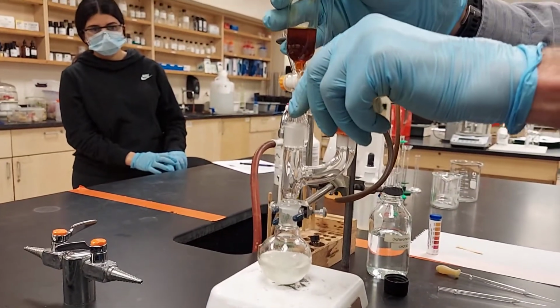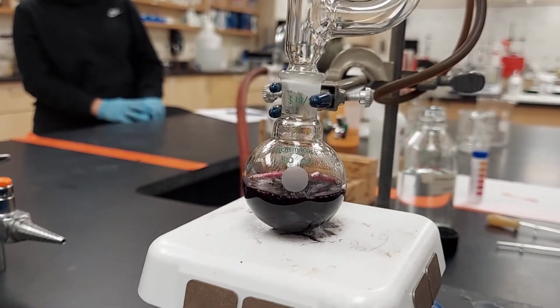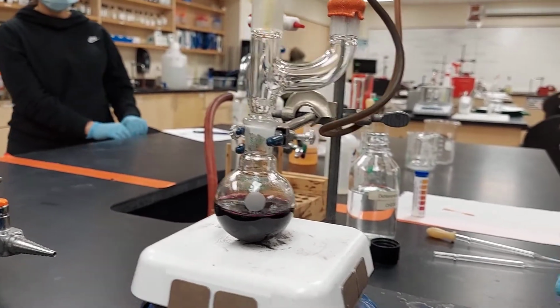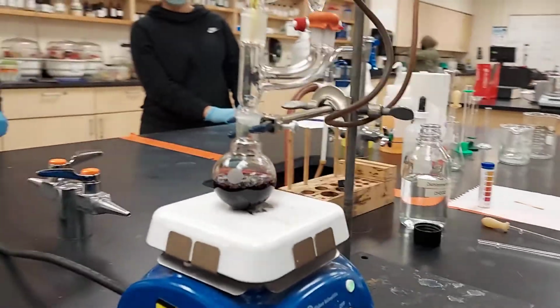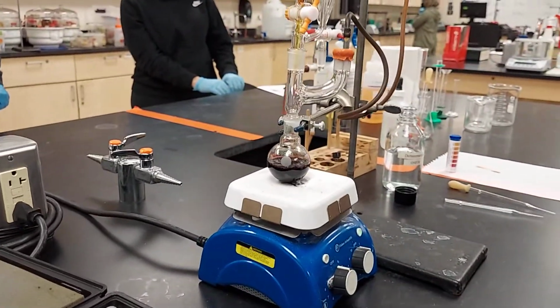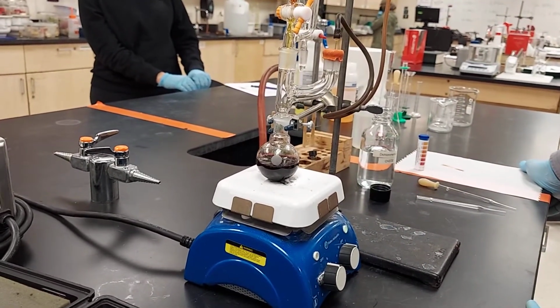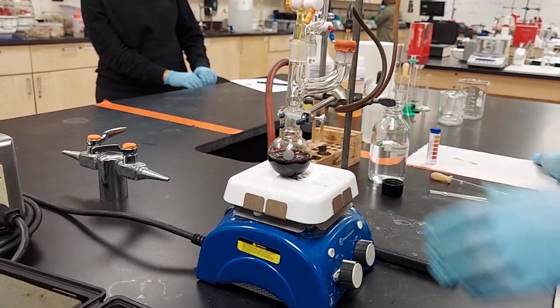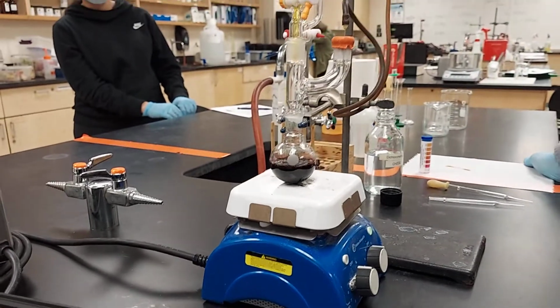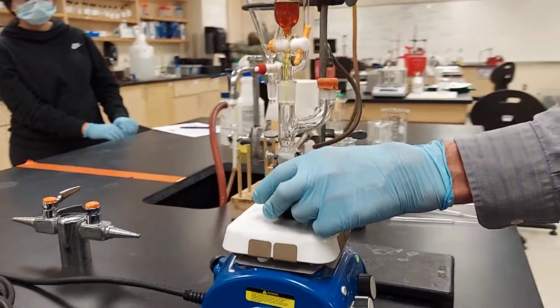There it comes. Oh yes. Nice purple. And we're going dropwise. Now we should be careful. This is a very exothermic reaction. If it starts generating too much heat and this starts boiling, we could be in trouble. So if it does get hot, I could put a cool water bath to trap the heat. But I'm not sensing it's getting warm.